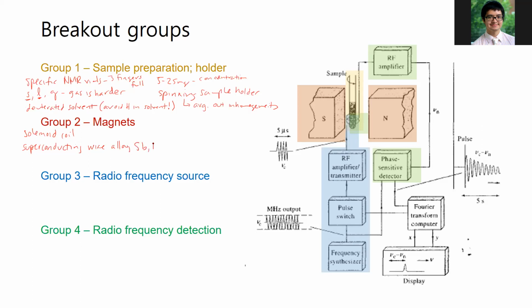And then of course the feature of the NMR is that for superconducting in NMR, you have to reach very low temperatures, around 4 Kelvin. So to reach that, they surround the magnets in liquid helium, and then they actually surround the liquid helium in liquid nitrogen to protect it from the ambient environment of the room. And superconducting magnets seem to be pretty common these days for NMR.